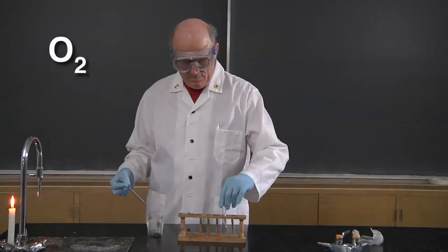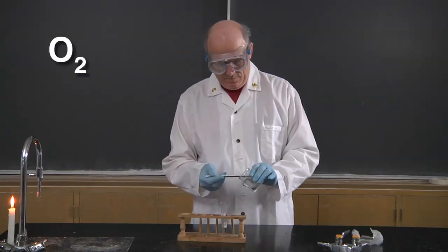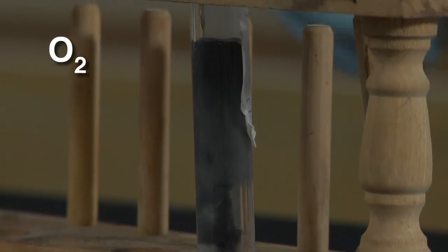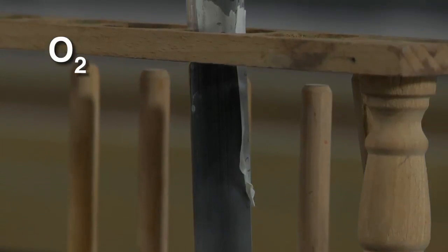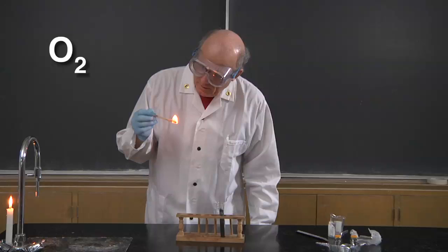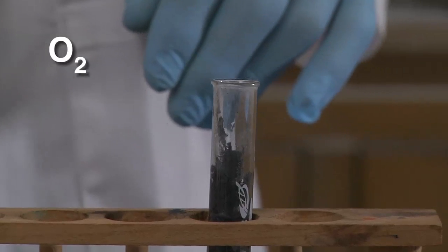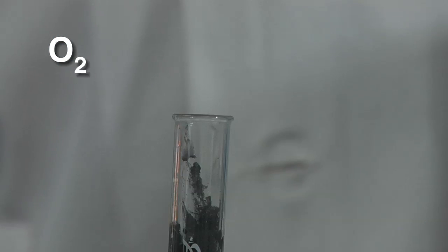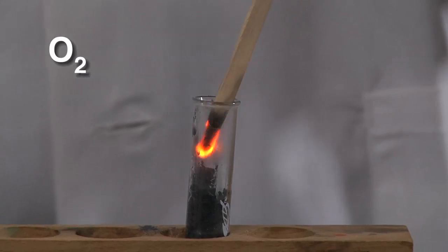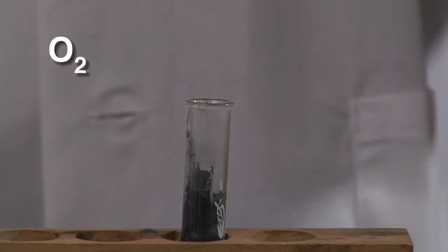Use a clean, dry spatula to scoop some manganese dioxide from the beaker. Add the manganese dioxide to the fresh 3% hydrogen peroxide in the test tube. The reaction will begin quickly. Prepare the glowing splint as the reaction continues. When the hydrogen peroxide reaction subsides, test the gas produced. Insert the glowing splint into the mouth of the test tube. The ember reignites. This is a distinct test for oxygen gas.